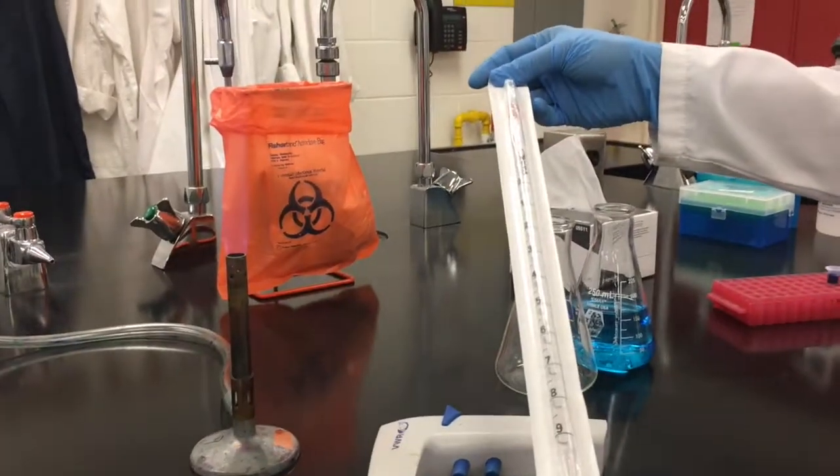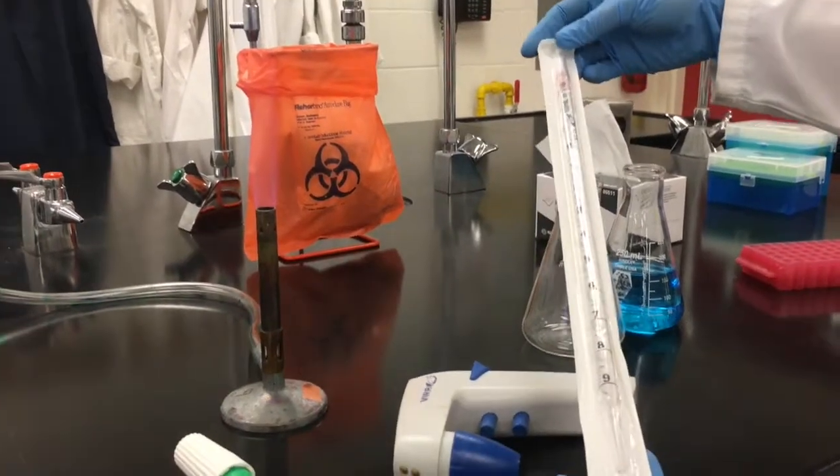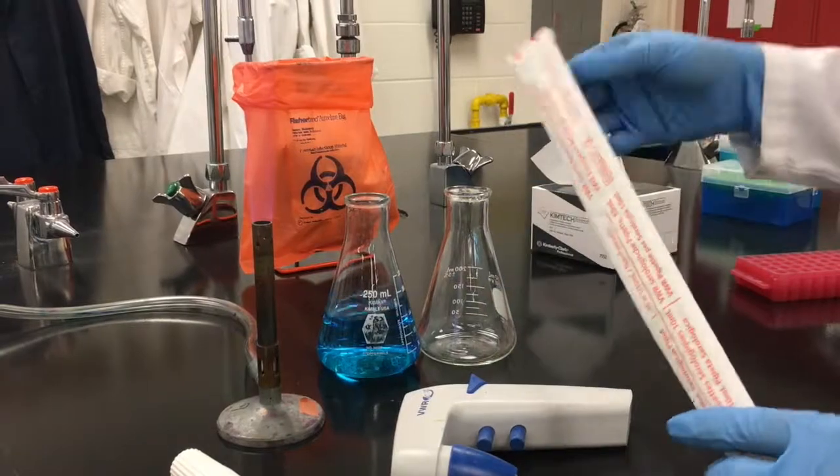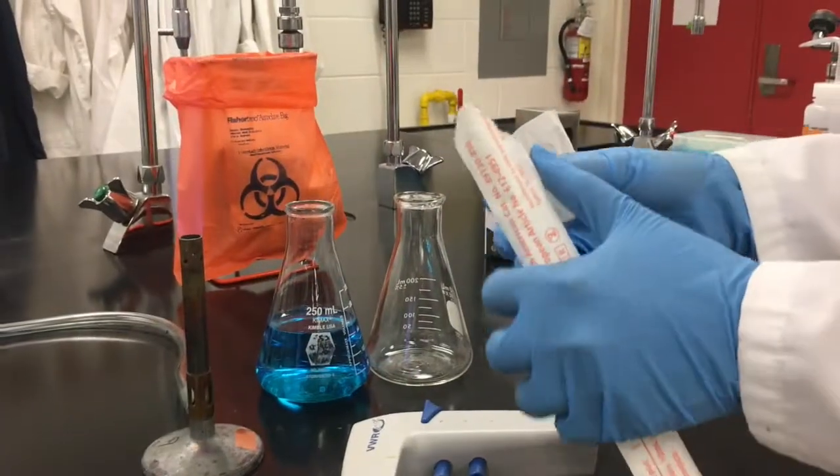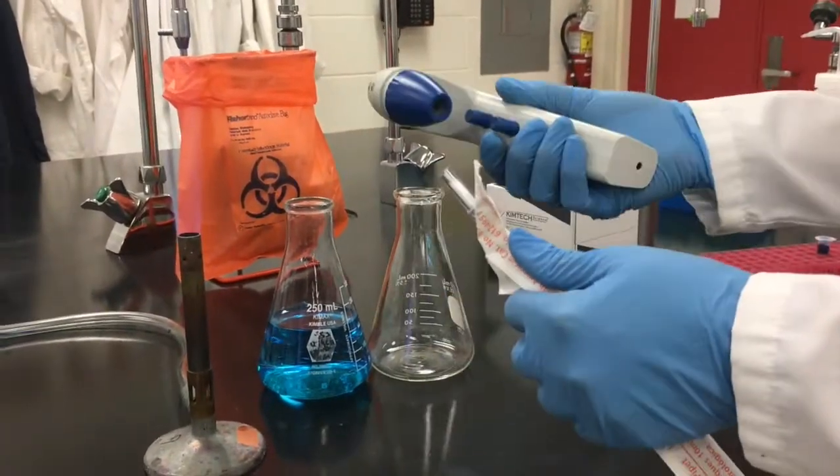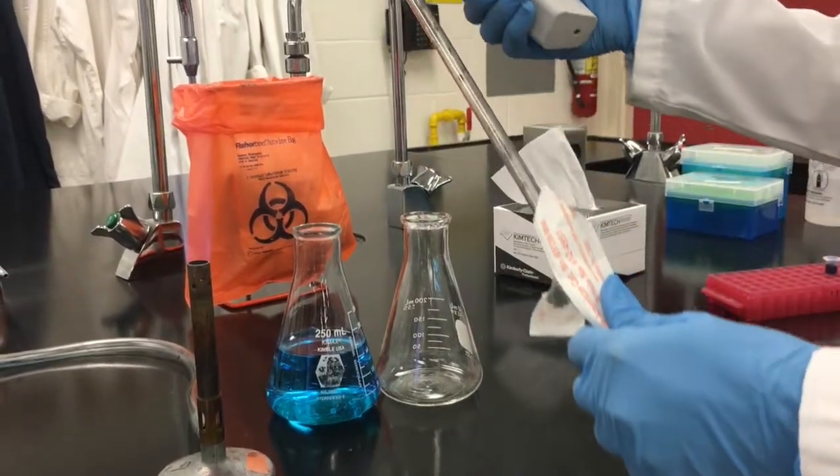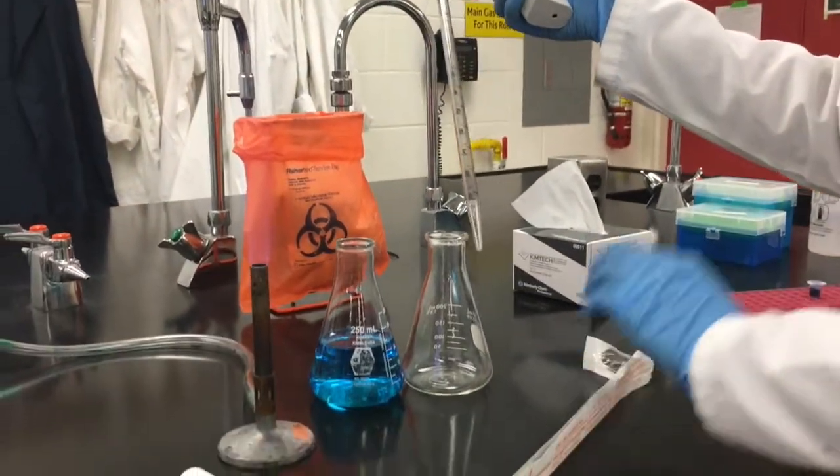We have selected a sterile plastic 10 mil serological pipette for a demonstration of this technique. Open the wrapper by peeling it apart and set it aside as we will need it for disposal purposes. Grasp the tip close to the end to be inserted into the pipetter. When using a glass tip this is very important to reduce the risk of breakage and causing injury.